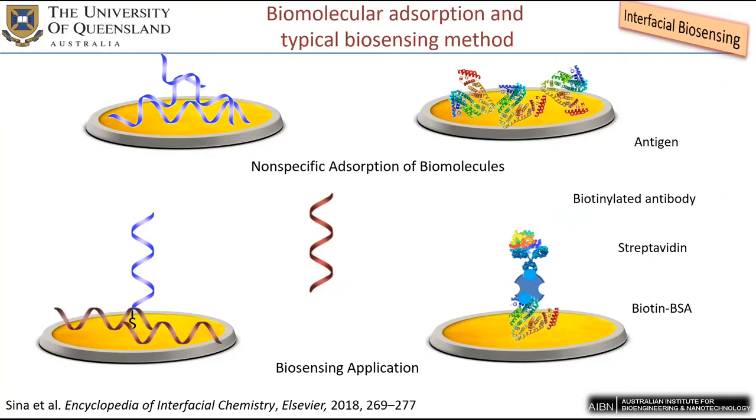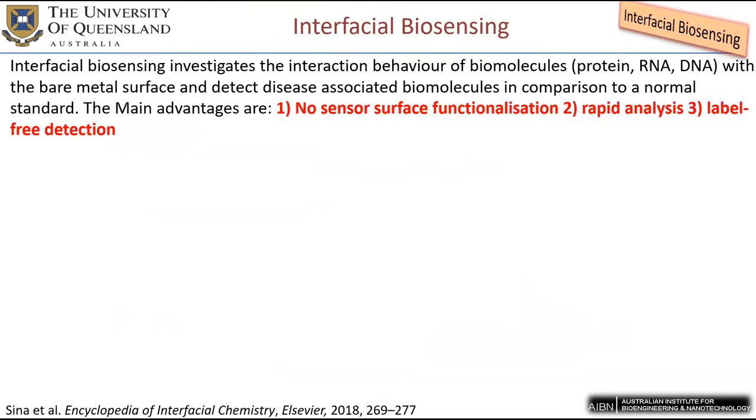And one of the major drawbacks of these sensing platforms is non-specific adsorption of your target molecules onto the sensor surface, which creates a significant amount of false positive signals. So to avoid these limitations, we developed the interfacial biosensing technique, which investigates the interaction behavior of biomolecules such as protein, RNA, and DNA with the bare metal interface and detects disease-associated biomolecules through this interaction in comparison to a normal standard.